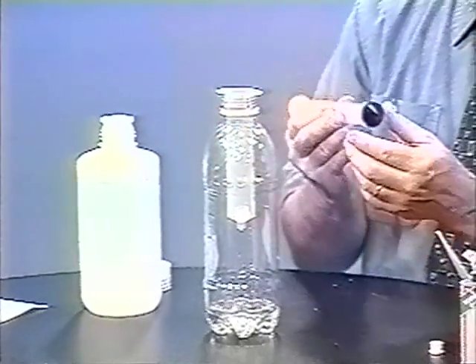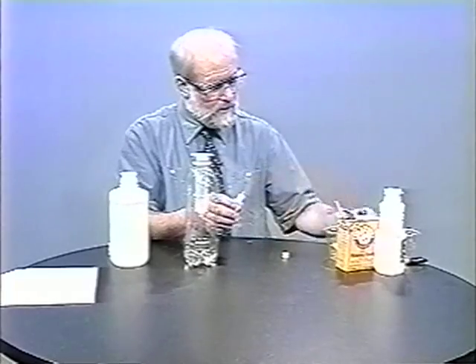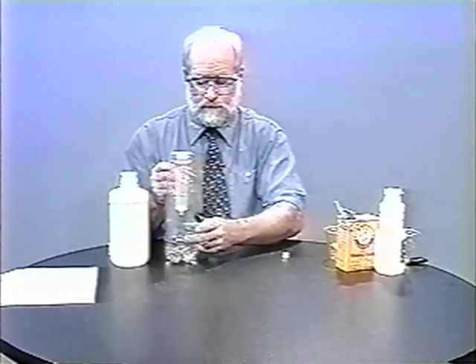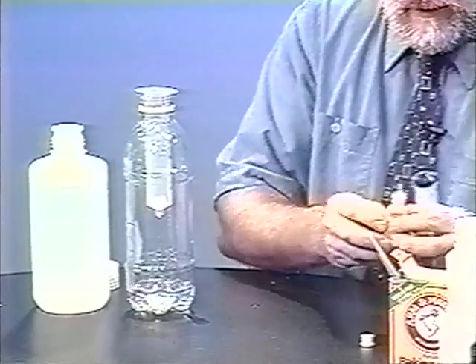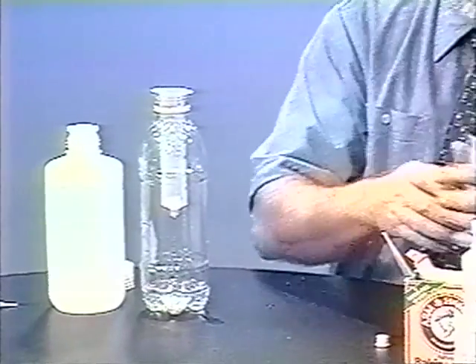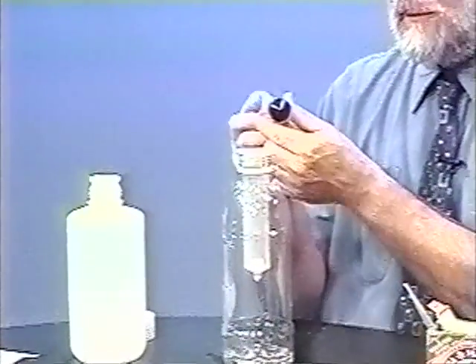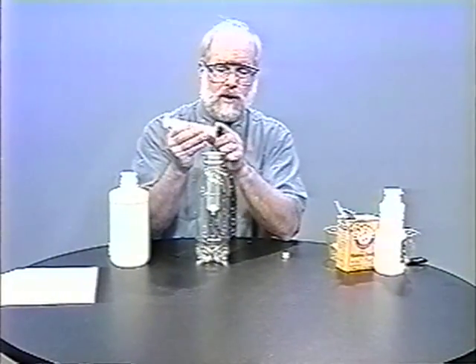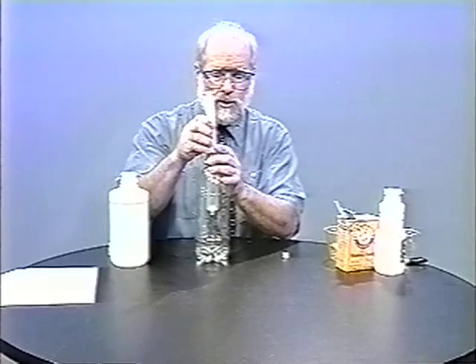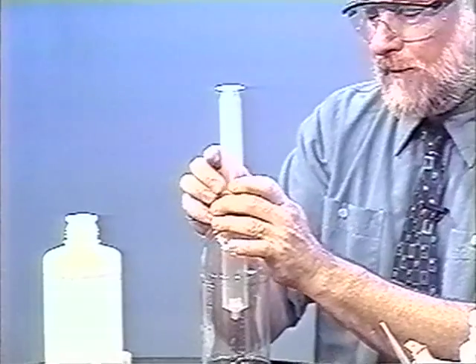Now we want to put the plunger in, but we'll need to first lubricate the diaphragm with some vegetable oil. I just use a few drops in the groove of the diaphragm. The pop bottle or flask will help us because there's a little catch on the top of the barrel, and this plastic part of the plunger has to get past that catch. As I'm starting to push it in, you'll hear us going past it — right there.